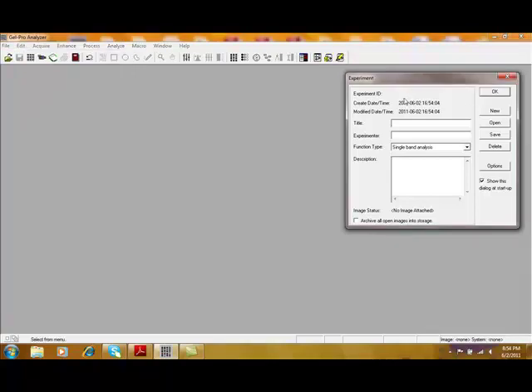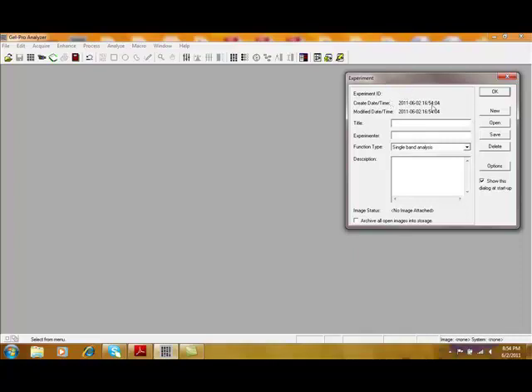The purpose of the Experiment Dialog box is to create an experiment and include information with that experiment that you can review later. This box is also used for saving experiments that you can rerun later on different gels.